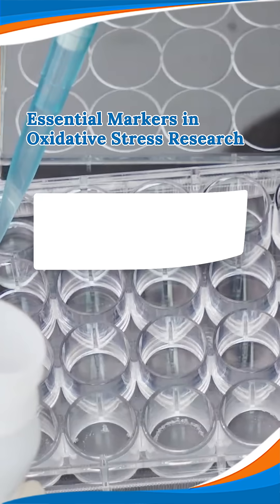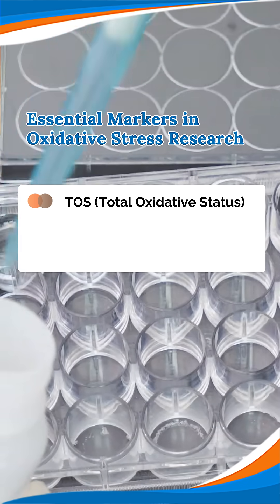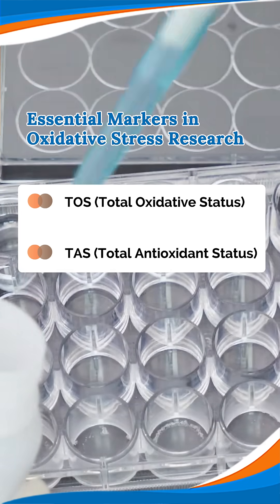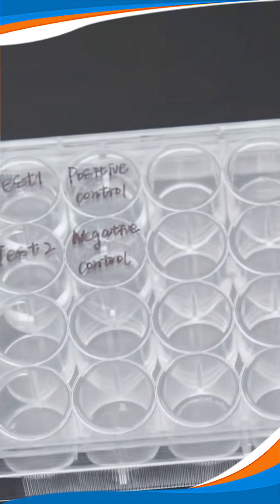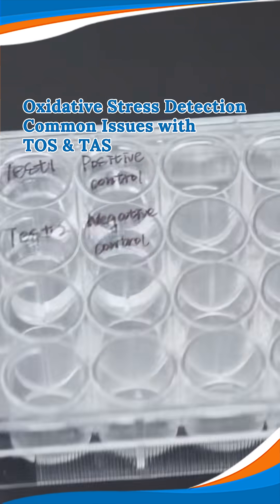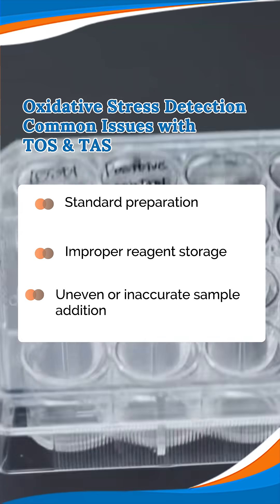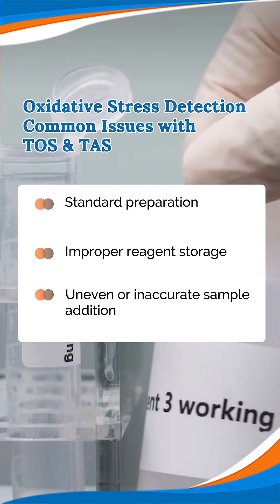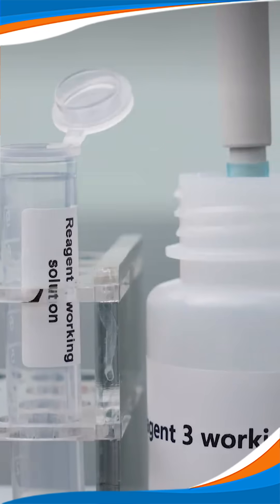In oxidative stress research, TOS and TAS are key indicators. Today, we'll focus on common issues in reagent preparation, storage time, and sample addition, and share tips to optimize them.